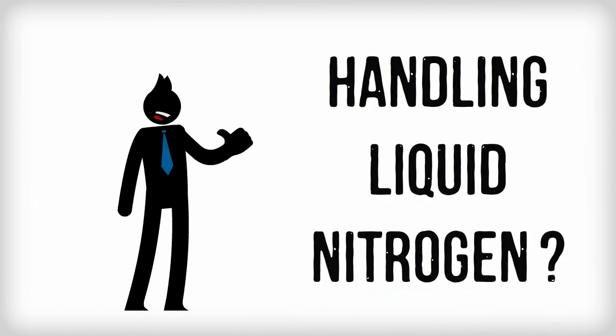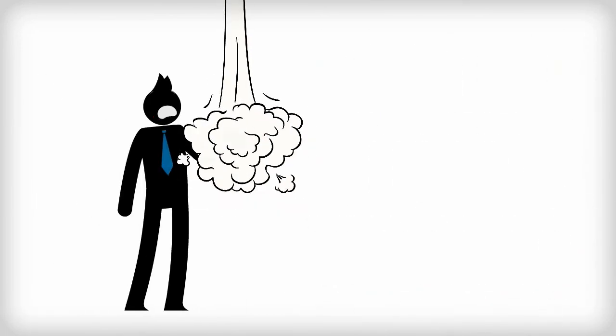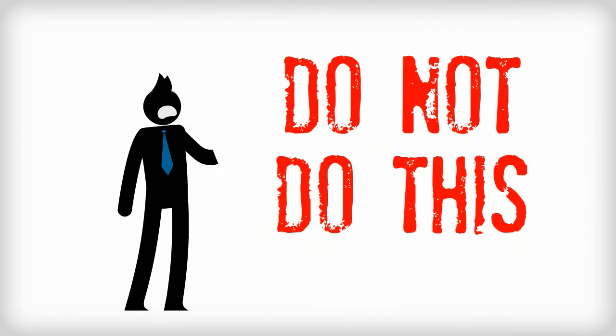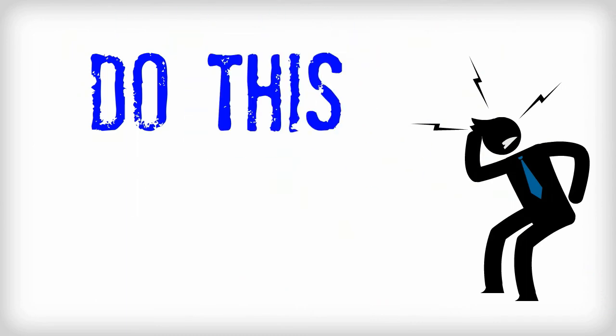Are you handling liquid nitrogen and don't want this to happen to you? We've got the gloves to protect you.